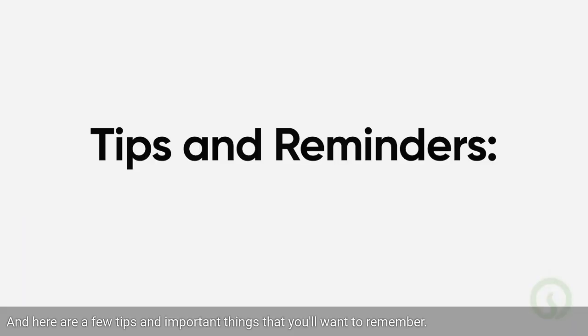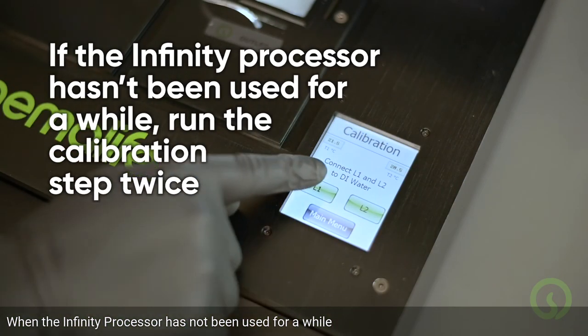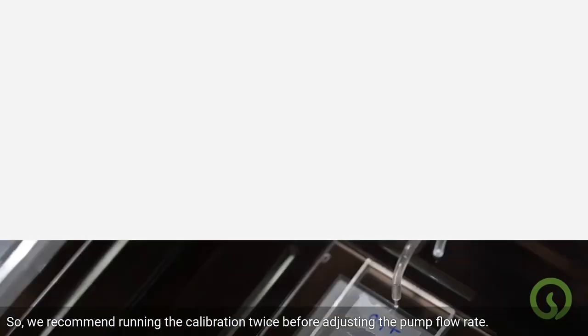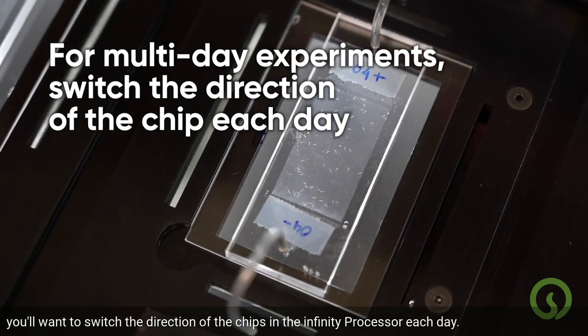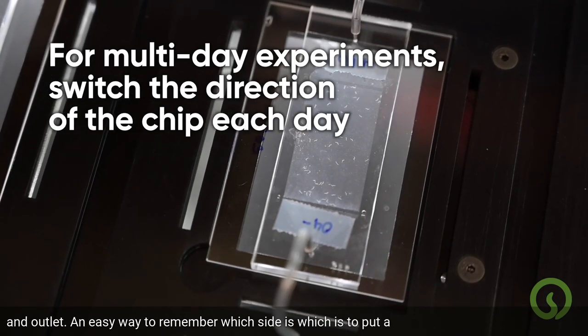Here are a few tips and important things to remember. When the Infinity processor has not been used for a while, there might be some air in the lines, so we recommend running the calibration twice before adjusting the pump flow rate. If you are conducting a multi-day experiment with the same Infinity chip, switch the direction of the chips in the Infinity processor each day to prevent any possibility of the progeny clogging an outlet.